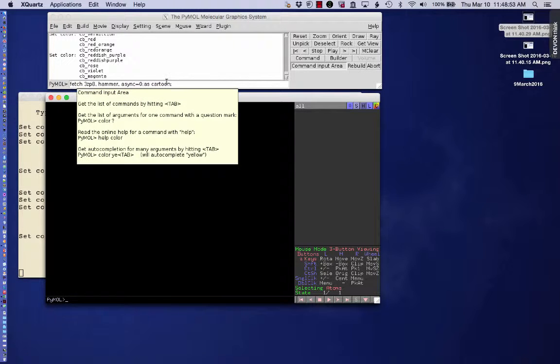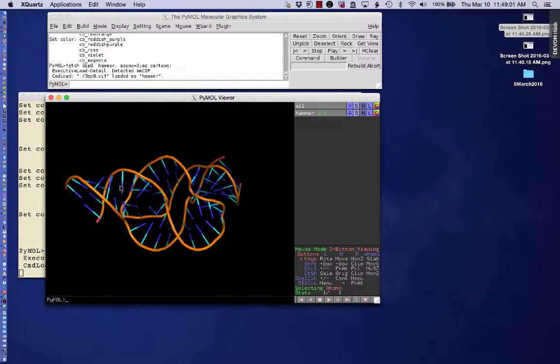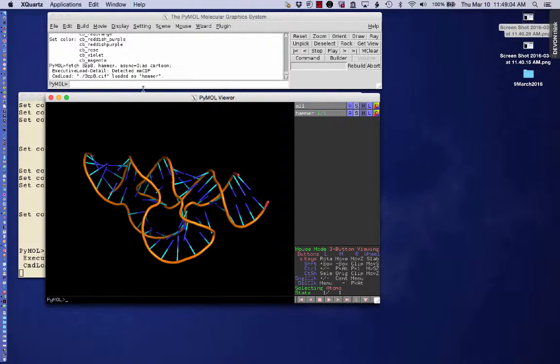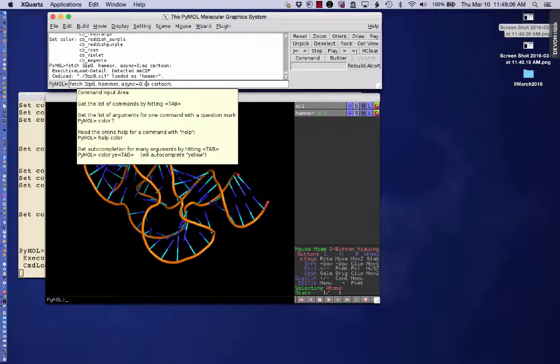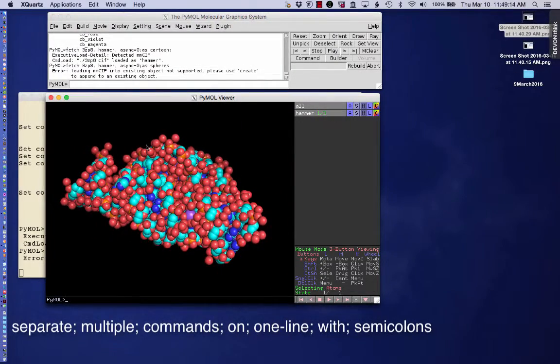The assembly of a horizontal script on the command line eliminates or reduces the need to use an external text editor. You can edit the arguments of the keywords by moving the cursor on the command line. When you're done with your changes, you hit Enter or Return to see the changes take effect in the viewport of PyMOL. This avoids the hassle of finding and loading a script file and reloading as you edit it.